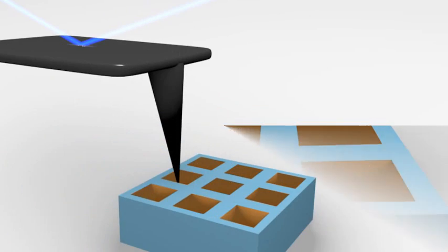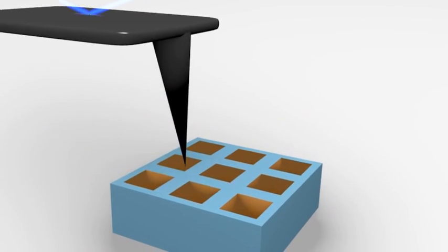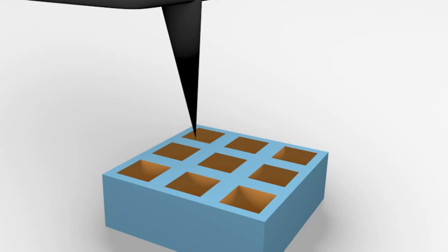The radius of such tips can be below 10 nm, which allows surface features to be revealed at the nano scale.